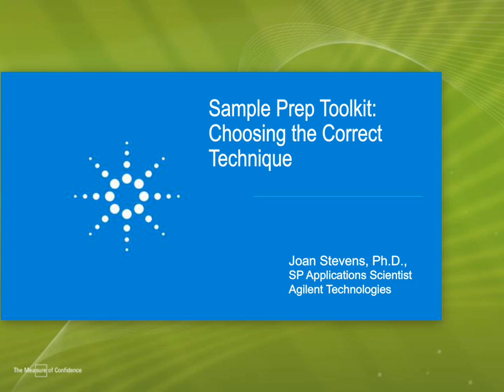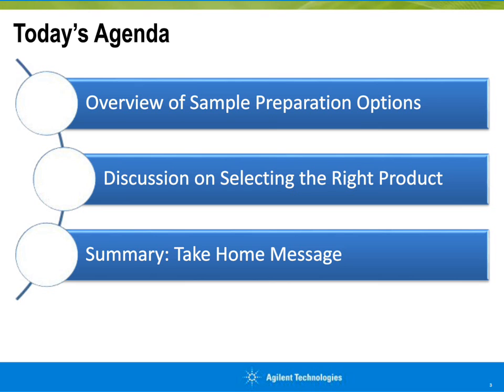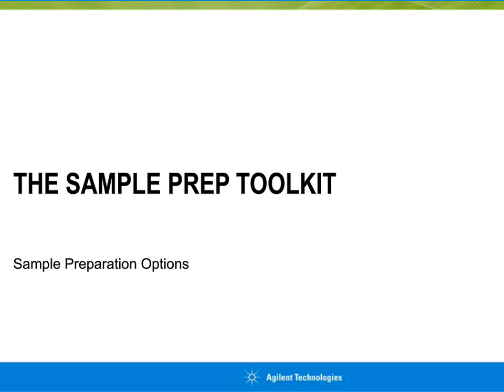My topic, my first talk, is going to be on the sample prep toolkit: choosing the correct technique. Today, we're going to have an overview of sample preparation options, discuss how to select the right product, and then our take-home message regarding sample prep. So let's begin with our sample prep toolkit.